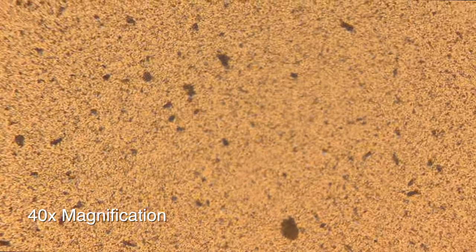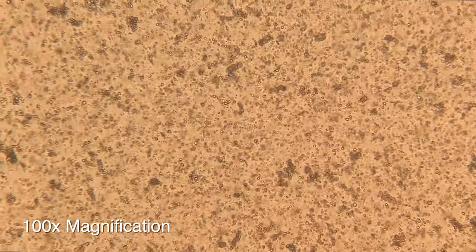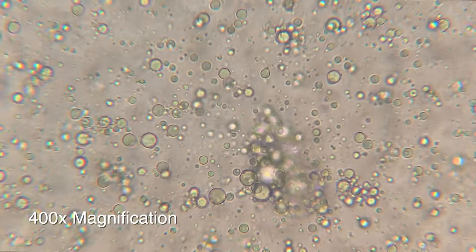As you can see, there are some very large chunky things in here. Those are the fat globules. It's cool to see them larger and see how they clump together like this. Again, the only reason that cow's milk looks different than this is that cow's milk is homogenized, which makes the fat globules a lot smaller.